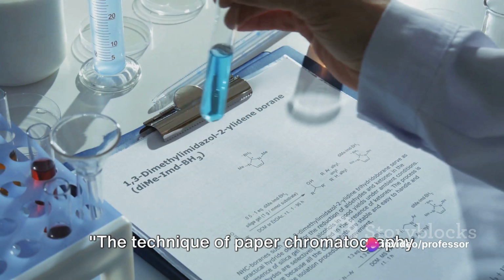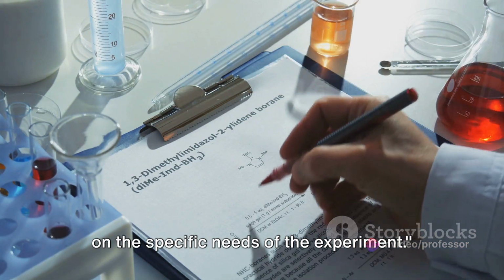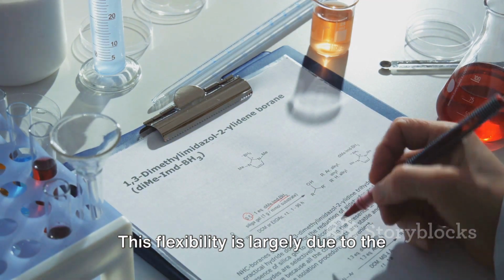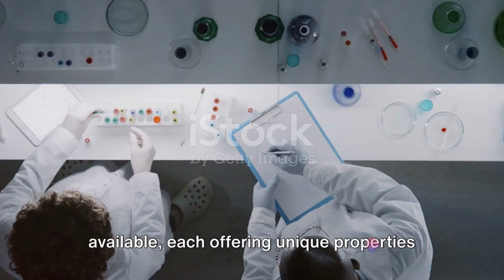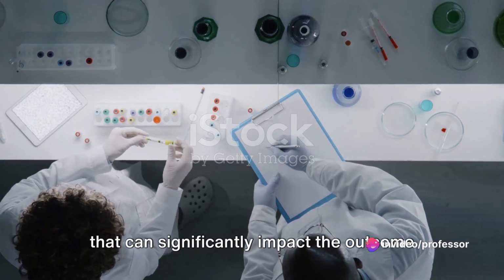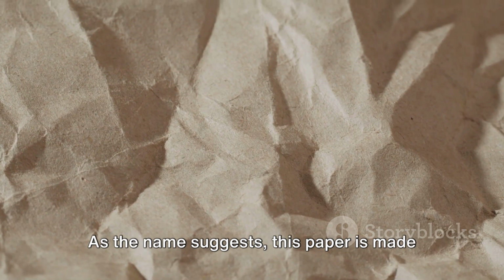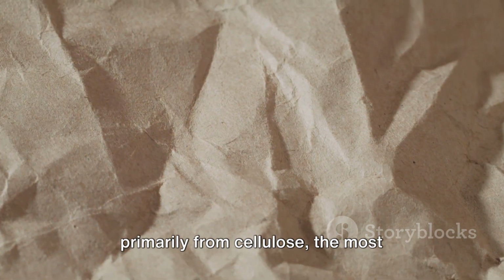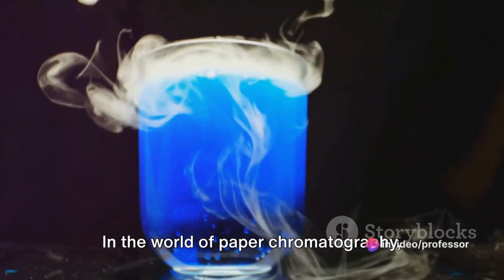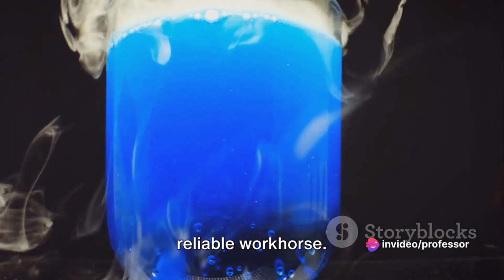The technique of paper chromatography can be adapted in several ways, depending on the specific needs of the experiment. This flexibility is largely due to the variety of chromatographic papers available, each offering unique properties that can significantly impact the outcome of an experiment. First up is cellulose paper. As the name suggests, this paper is made primarily from cellulose, the most abundant organic polymer on Earth. In the world of paper chromatography, cellulose paper is the equivalent of a reliable workhorse.